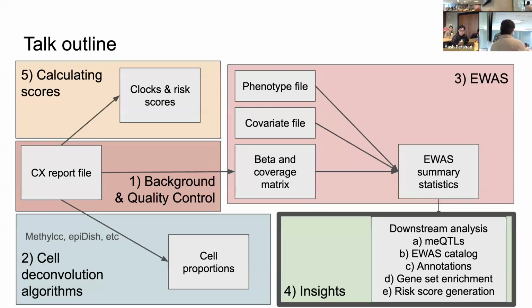And if anyone's interested in how you might chunk or do region-based permutations, the ones I mentioned on the back end, I'm happy to talk about that. I don't think it's pertinent right now, but if you're trying to understand biologically relevant clumping of your effects, chat with me if you're interested in that on the back end of things. Okay, so yeah.